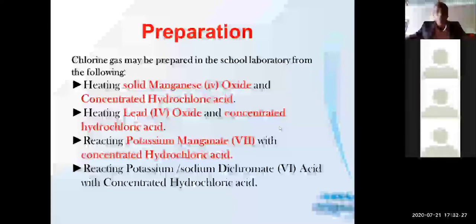Then reacting potassium manganate(VII) with concentrated hydrochloric acid. Then also reacting potassium dichromate(VI) or sodium dichromate(VI) with concentrated hydrochloric acid.